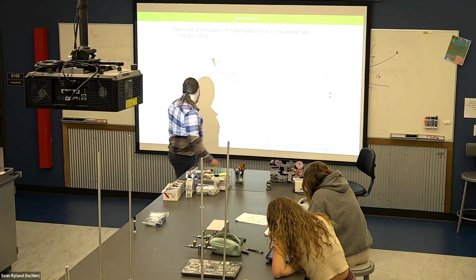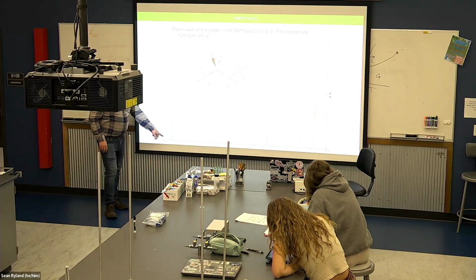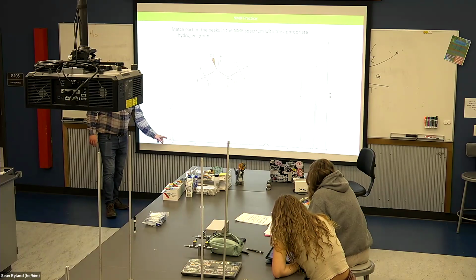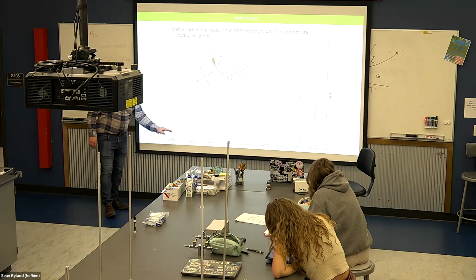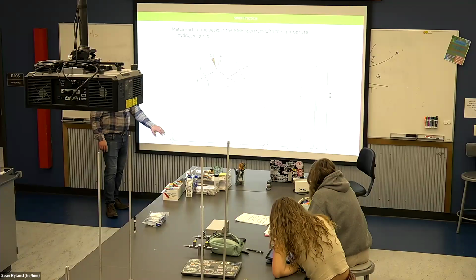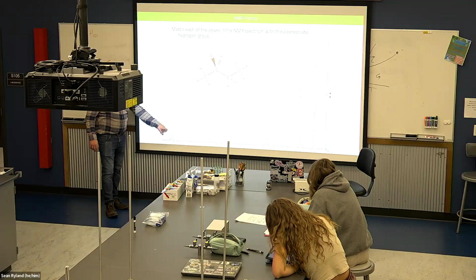So here's real data. We know that that's one signal because even though there's a whole bunch of peak splitting going on here, it looks really neat and symmetric and bell curve shaped. So we zoom in on that and see 1, 2, 3, 4, 5, 6. That means there's a carbon that has hydrogens on it, and those hydrogens have 5 nearest neighbors.